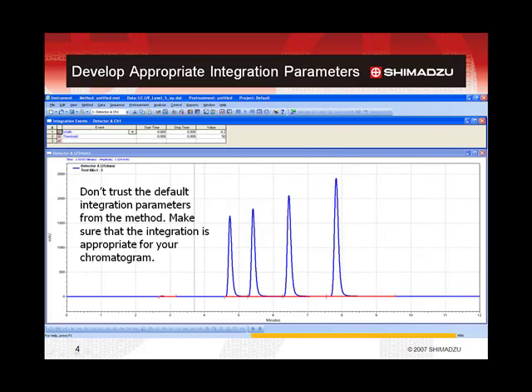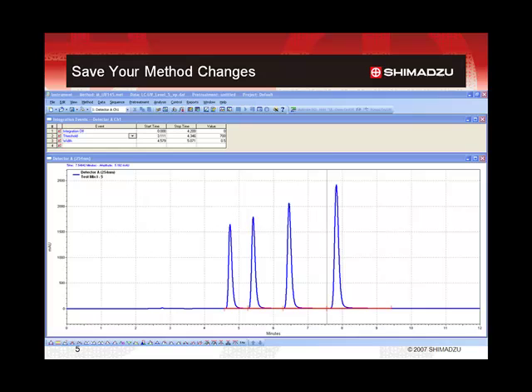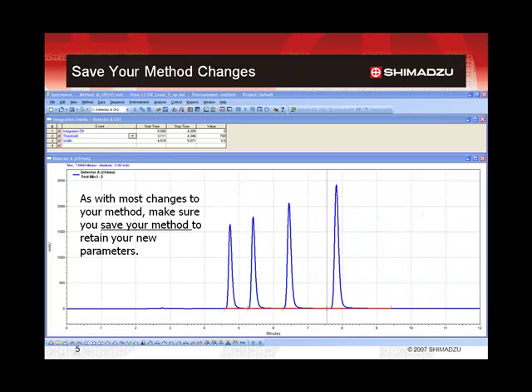All new methods will contain default integration parameters. These are rarely the best choice for processing the peaks of the standard chromatogram. Follow the software procedure for setting more appropriate integration event parameters to produce the peak processing results that are optimal for the purpose of the method. As parameters are changed or added to the method, it is important to guard against loss of your work. Please save your method periodically to retain your new method settings.